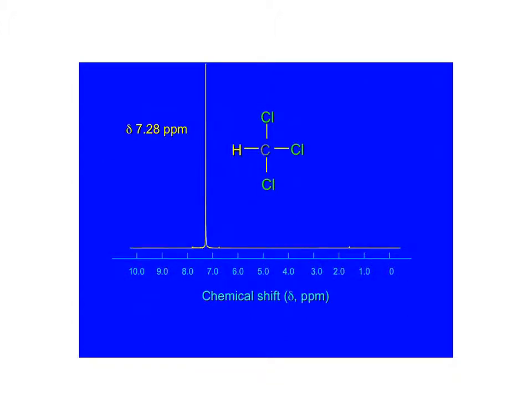And so that's what this is showing. We only have 1 hydrogen, so you just see 1 peak. This one doesn't show where the TMS would be, but the TMS would be occurring right here. So a lot of times when we draw it, and I have you draw yours, I'll just ask you to put in the 0. That way we know where 0's at. For the most part, if you notice the x-axis here goes from 0 to around 10 for proton NMR. For C13 NMR, it usually goes from like 0 to like 200. But it's at a different frequency, so you don't have to worry about them interfering with each other.